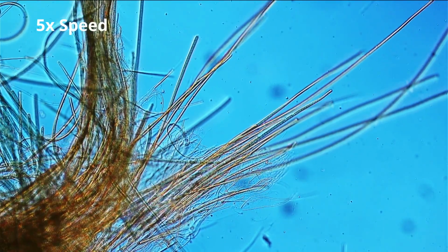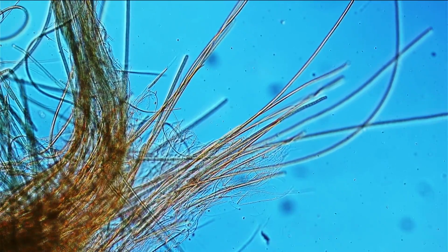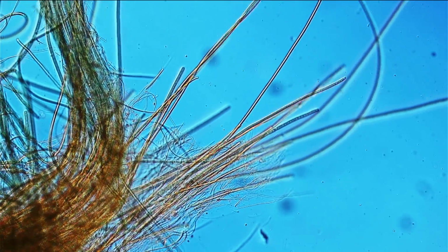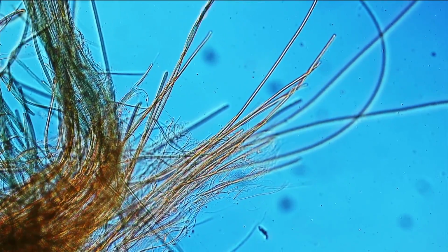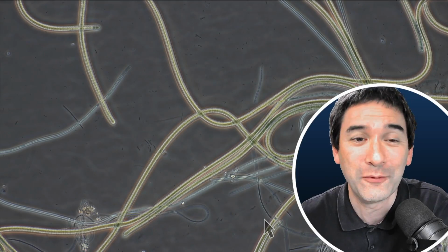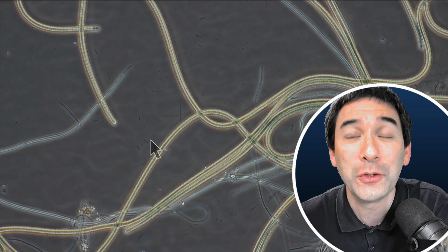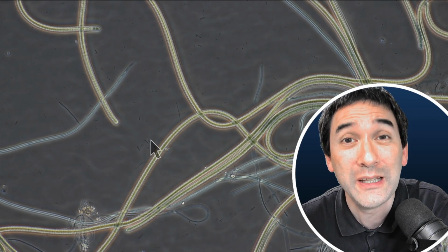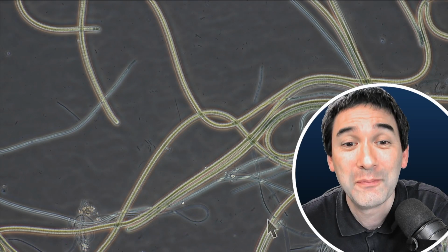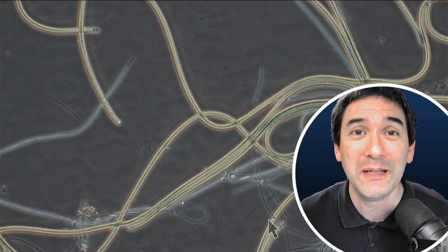So in other words, to put it into simple language, just because two things look similar under the microscope does not actually mean that they're related. And if two things look very different from each other under the microscope, like for example, those cyanobacteria and the other bacteria that you see here, they look very different, but actually they can be quite related as well. You see, that's, I think, one of the very important concepts in biology.